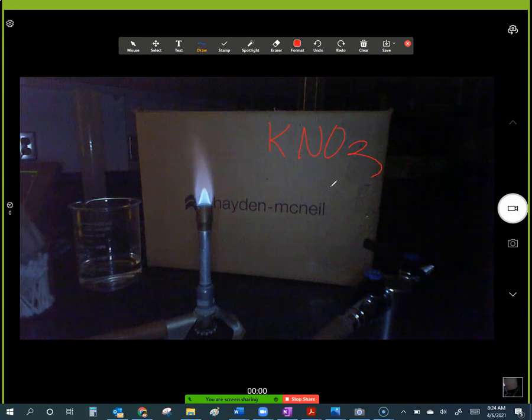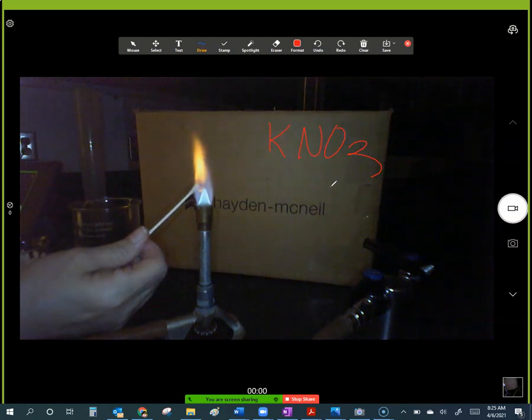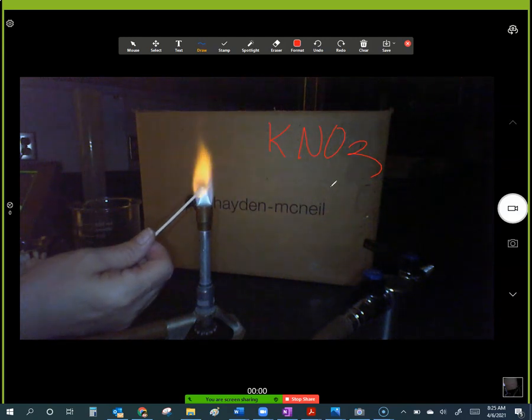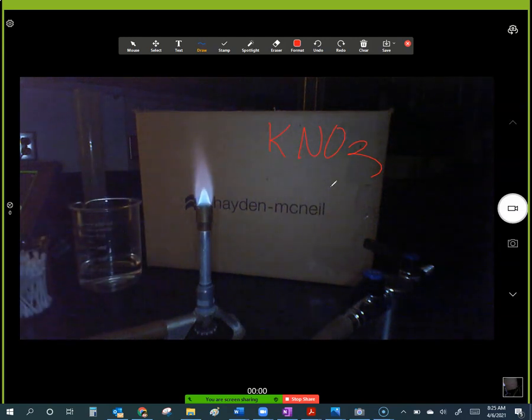All right, now we're going to do a sodium. What color you got there? Bright orange. Is that different than the potassiums? The potassiums were more of a peachy color, and this is more of a yellowy orange. Okay. The next one.